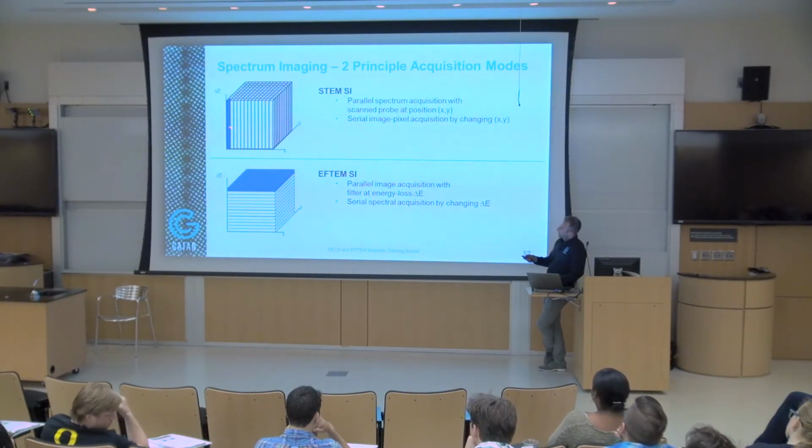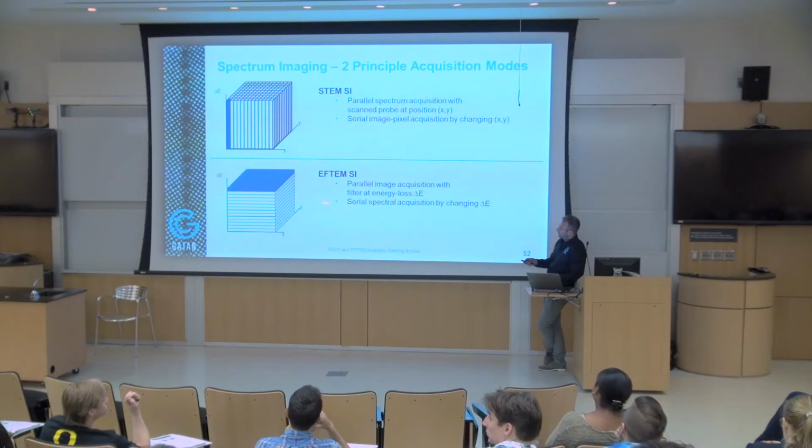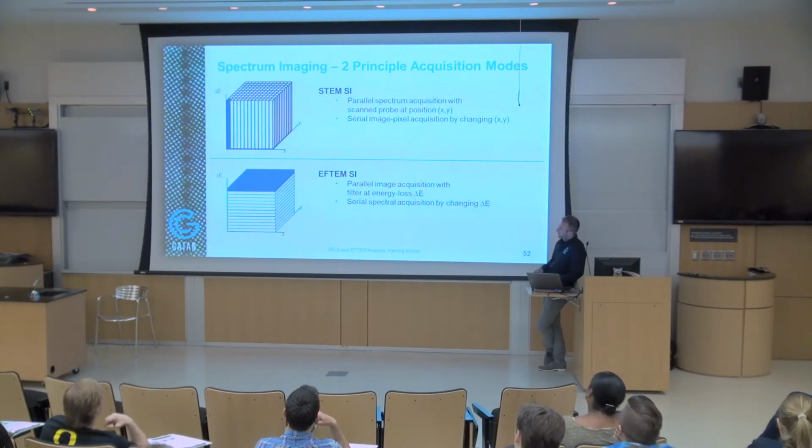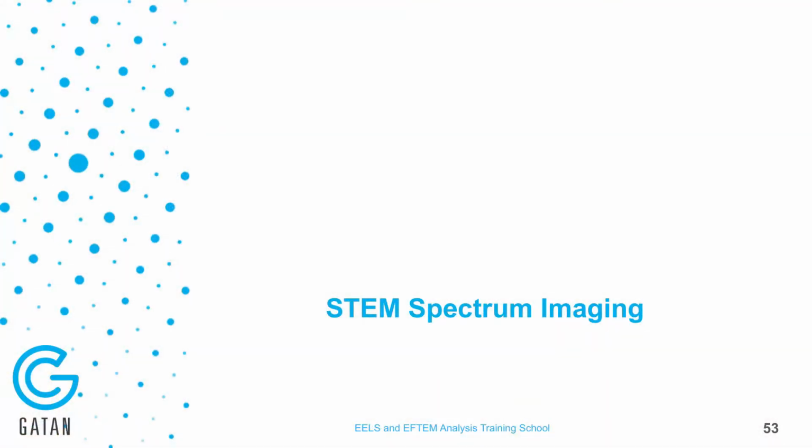This is a parallel acquisition of your EELS spectrum. In this case, it is a serial acquisition because we actually change the energy, little by little, adding an energy plane, okay? But like I said, you get to the same result in the end.